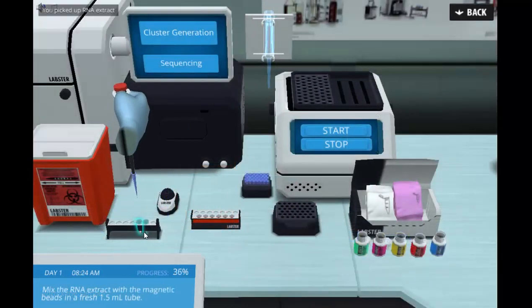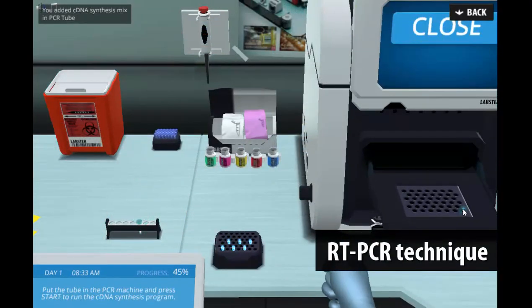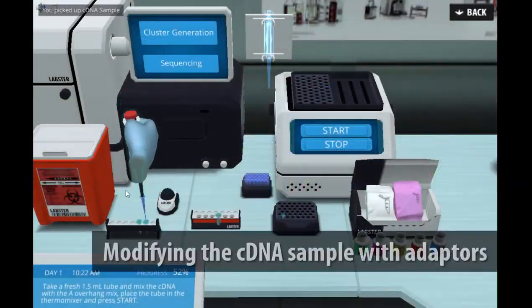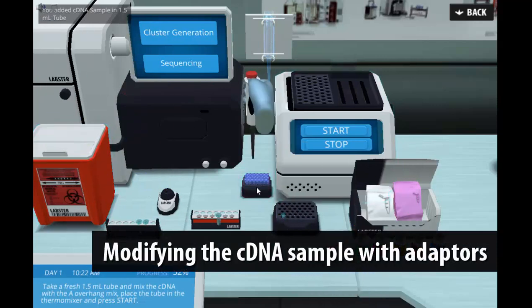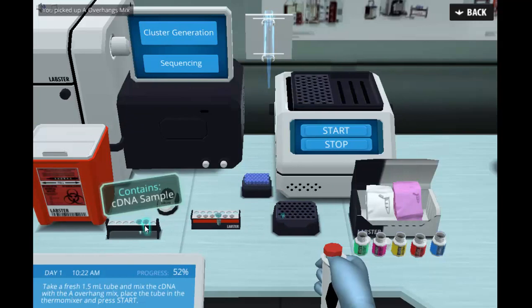Students will isolate and purify the mRNA and utilize the RT-PCR technique to synthesize cDNA. After that, they will modify the cDNA sample with adapters to be able to use the next-generation sequencing, or NGS, technique.